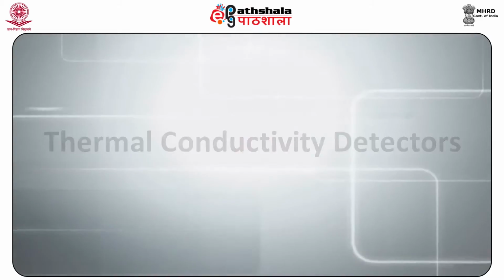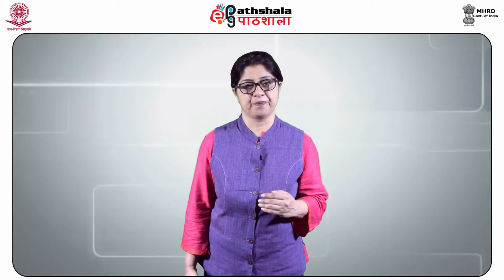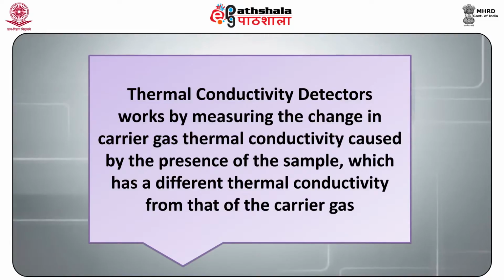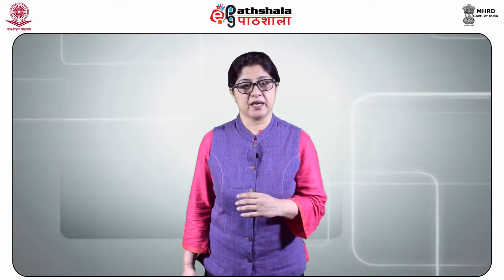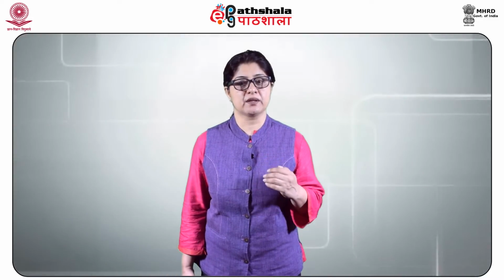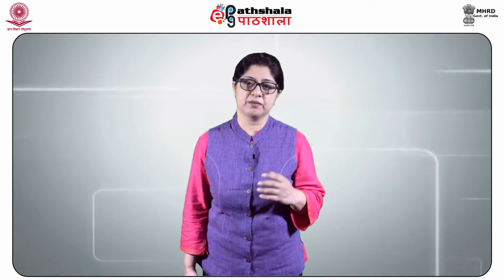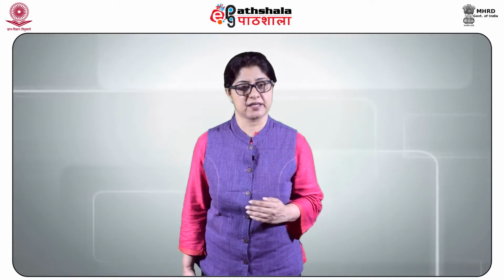Thermal conductivity detectors. Thermal conductivity detectors (TCD) were the first detectors developed for use with gas chromatography. The TCD works by measuring the change in carrier gas thermal conductivity caused by the presence of the sample, which has a different thermal conductivity from that of the carrier gas. Their design is relatively simple and consists of an electrically heated source that is maintained at a constant power. The source is usually a thin wire made of platinum or gold. The temperature of the source depends upon the thermal conductivities of the surrounding gases. The resistance within the wire depends upon temperature, which is dependent upon the thermal conductivity of the gas.